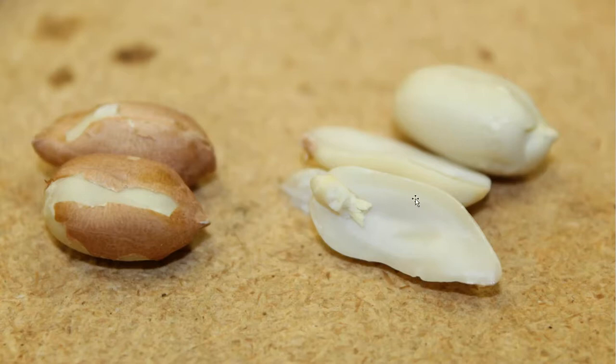Well, I'm not done with the peanuts yet. They are now naked. They're ready for my jacuzzi bath of the Soxhlet extractor, but before I do that, I'm going to have to chop them up. I'm going to have to put them in little bitty pieces so I can increase the surface area of the piece and be able to extract the oil a little bit better.